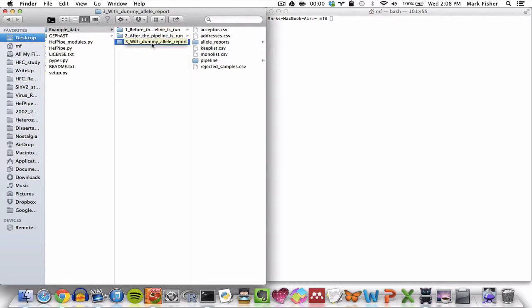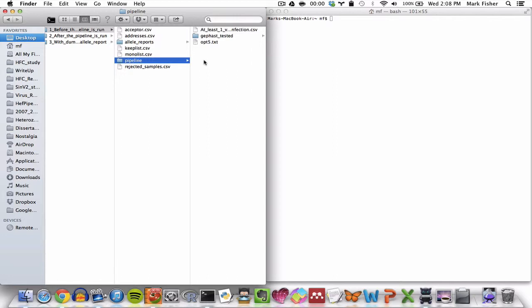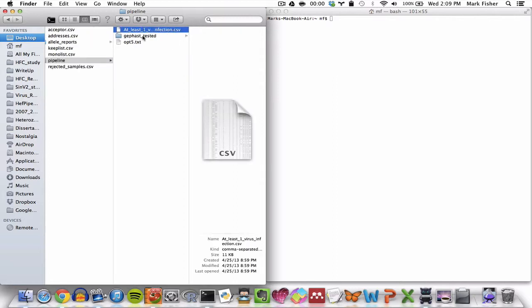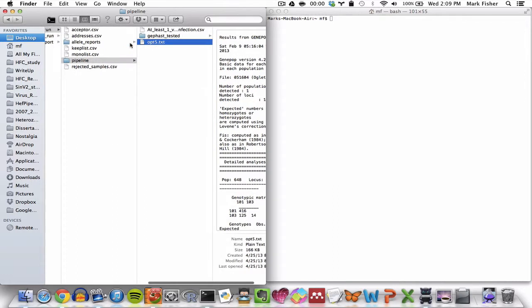Each of these subdirectories contains everything you need for a complete run of the pipeline. These files have been discussed in previous videos, but I should also mention that the pipeline directory for the example datasets will also contain a few example files for how downstream output should be converted into input for other parts of the pipeline.